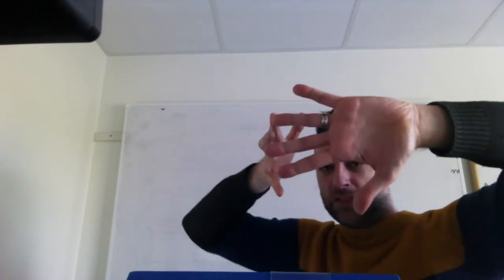And then I have B coming in from the other side, actually from the top side, but it comes out of plane direction. So my fingers will interlock here. Every finger will interlock with another finger. And so my A stream and my B stream come together here. At every interlocking point of my fingers, I get one stream and another coming together, and then they move together. So I have a big stream A and a big stream B. I split them into small streams. At every small connection, I connect them to each other.